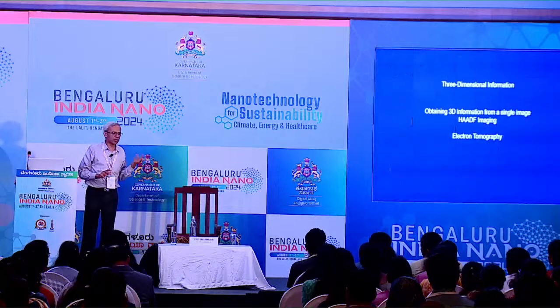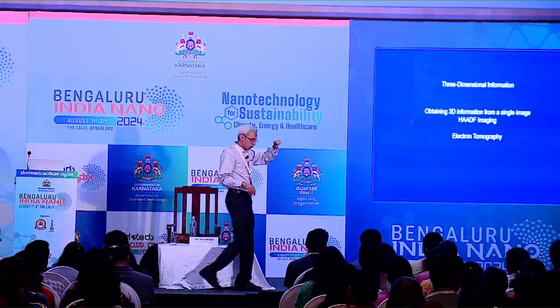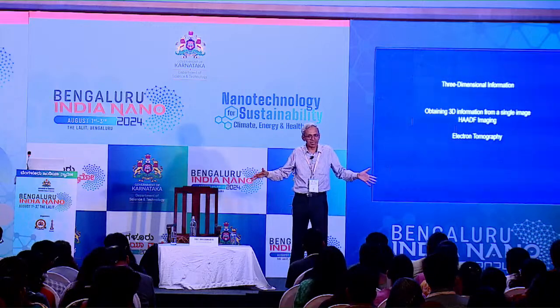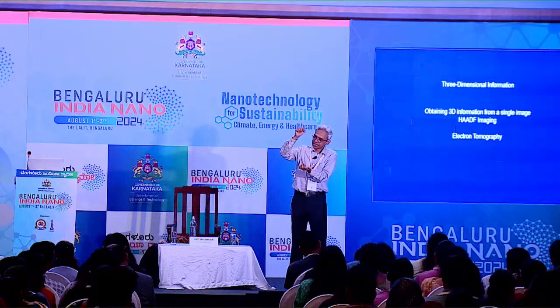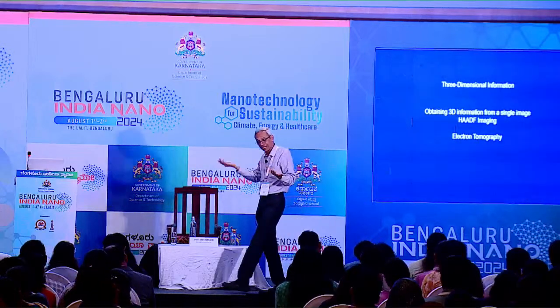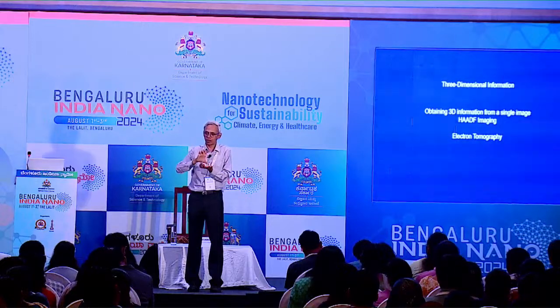There are 2 different techniques that we can use. One is the same information that I told you using your HAADF images, right? Remember, I told you that more scattering means something will appear brighter. More scattering means higher average atomic number or more number of atoms. 10 atoms will scatter more than 5 atoms will scatter more than 3 atoms. Therefore, if a column is more intense or appearing brighter, the number of atoms in that column also could be more.